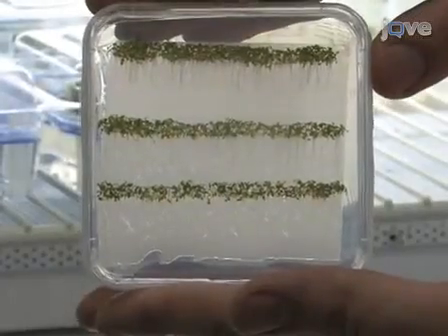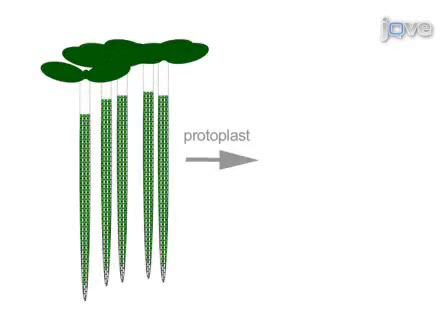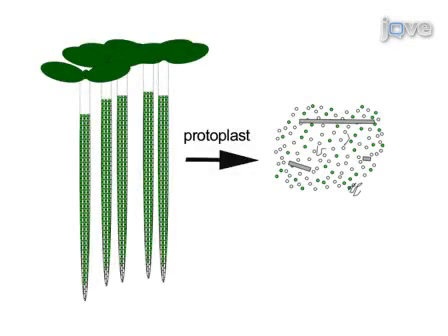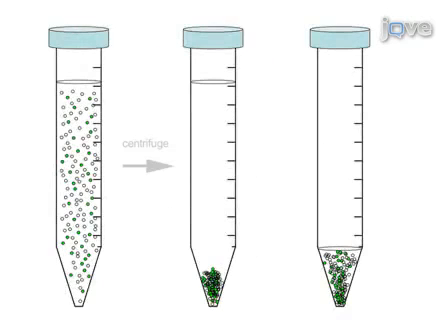Seedlings are grown in phytotrays or on agar plates. Their roots are harvested and treated with cell wall digesting enzymes. After 1 hour, the solution is filtered to remove large debris. The solution is then centrifuged and the supernatant is removed.